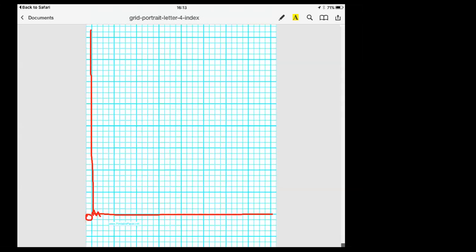So I will start, let this be 130 seconds, because my least reading is 130. Then let this be 140. Then I will make this 150. Then I can take this as 160. Let this be 170. And then of course this one will be 180, and this is 190. This is in seconds. I am going to plot the graph.